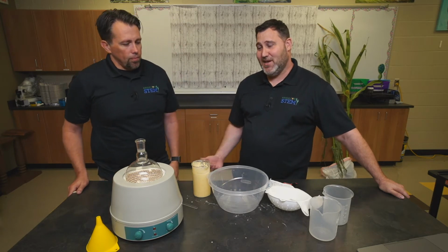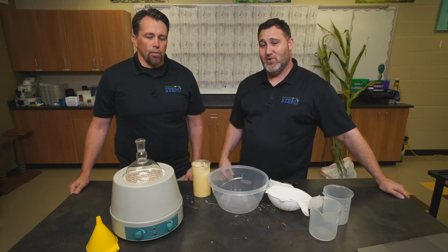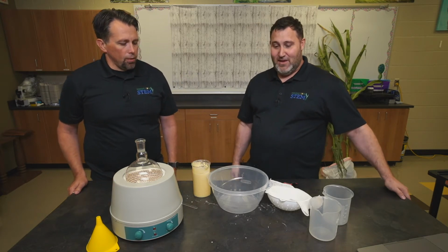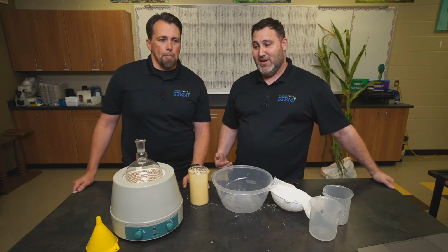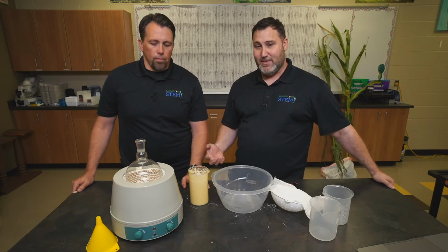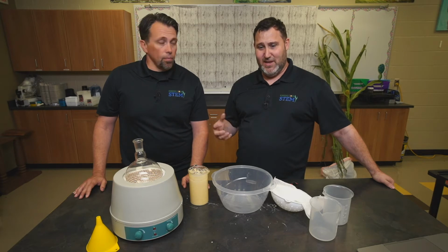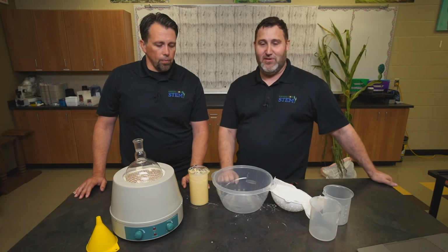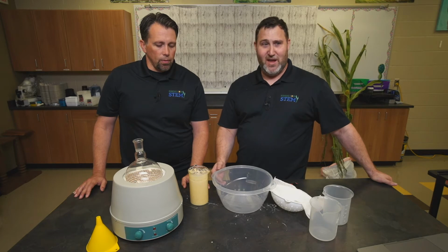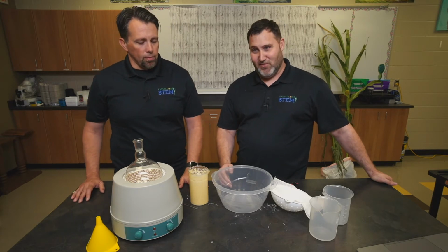Today, James and I are going to team up for this particular part of the Day 2 corn mash and distillation, because the procedure for distilling the ethanol out of our corn mash is the same for high school and middle school. One of the reasons we need to strain and get the solids out of our corn mash is because when we're using our distillation mantle, it can sometimes burn and get a lot of material in there that's really hard to clean out. In an actual ethanol plant, they would never go through this step. They distill the corn mash and all of the solids, because there is still quite a bit of ethanol in the solids. We just do this to better preserve our lab equipment.